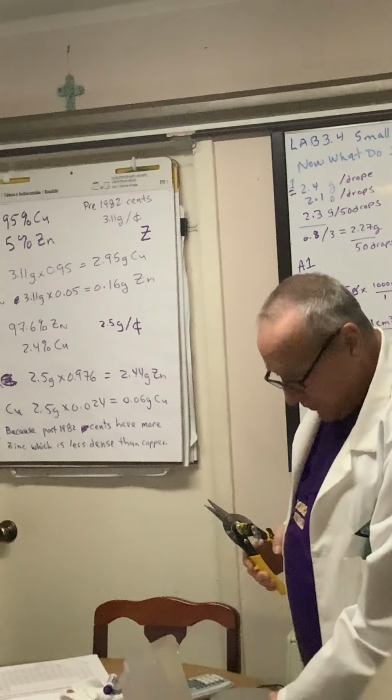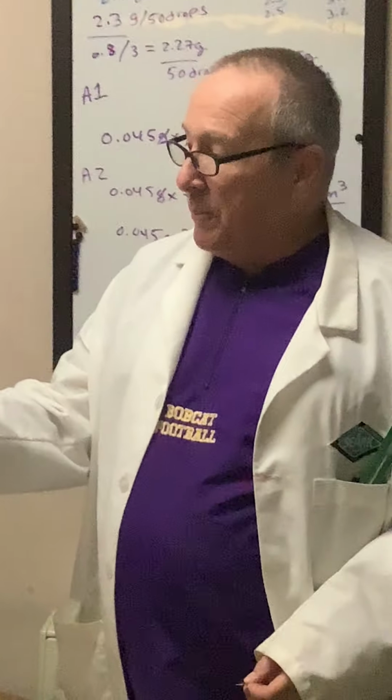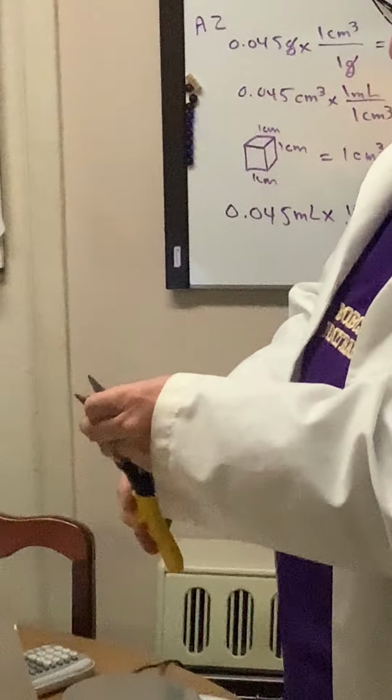And some of them I use up because I want to show you a modern penny. So we may have to get close on this, but here's a modern penny. I have a pair of Stanley tin snips here. And I'm going to cut this penny in half. And for this, I will put on my safety glasses. But I'm going to cut this penny in half and show you, I hope you can see, the inside is silvery zinc, and there's an extremely thin copper coating. We're going to separate these two components of pennies.